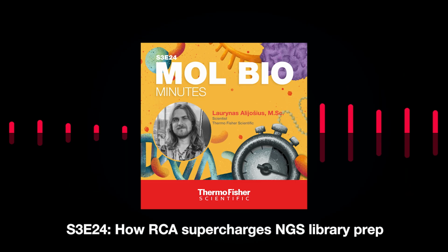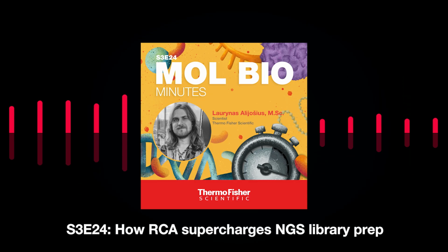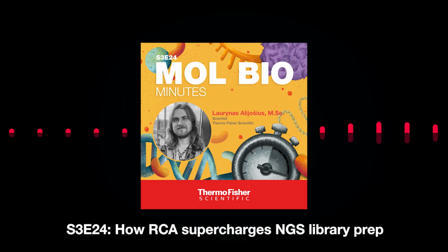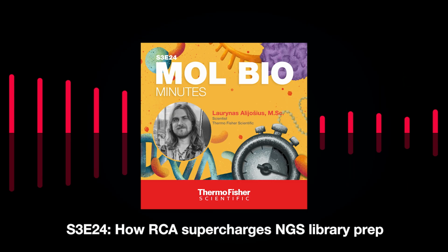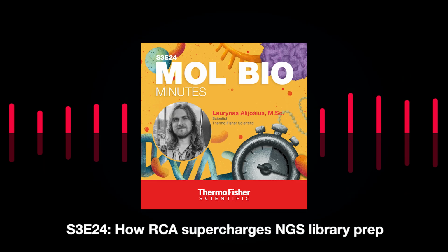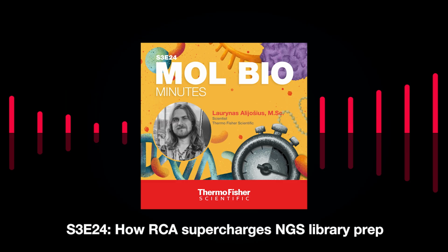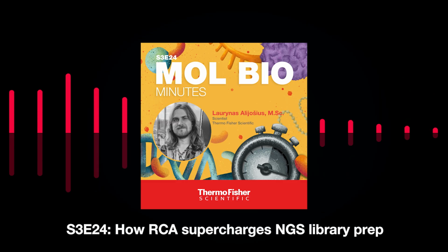For that, you can use S1 nuclease or T7 endonuclease 1. And then there's post-amplification cleanup as well. Clean DNA is often needed, and it's important to prepare an NGS library without disruptions. But no worries here as well. RCA products can be purified quite conveniently, either with magnetic beads or using an affinity-based spin column.